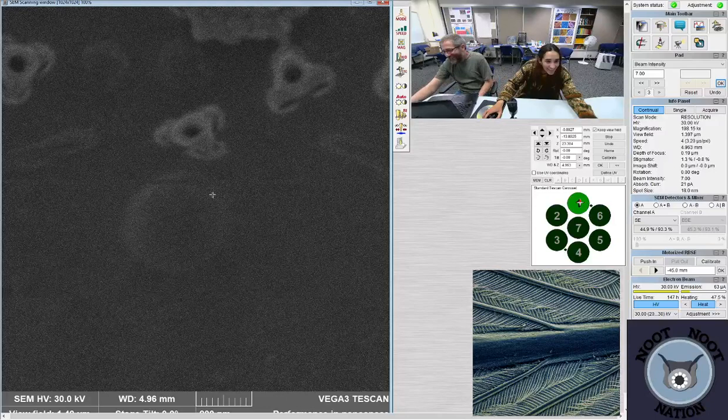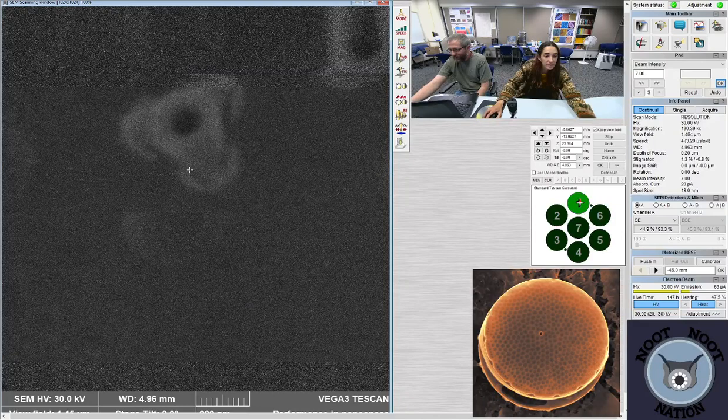Platinum's not first place. It is the best conductor, but it's a lot more expensive. Platinum? Yeah.